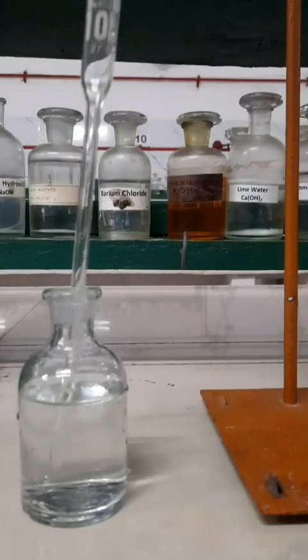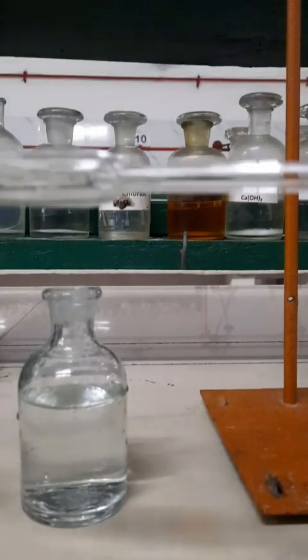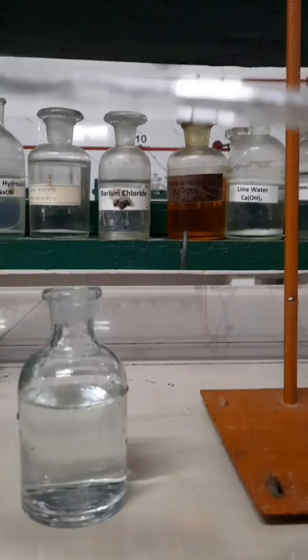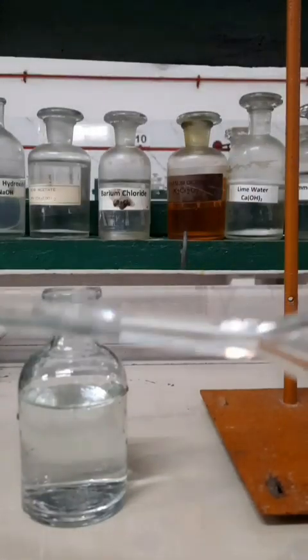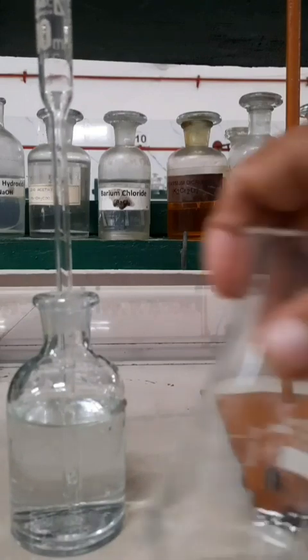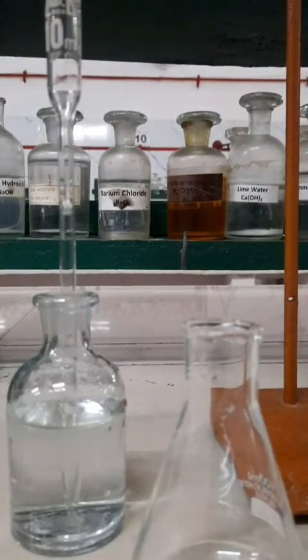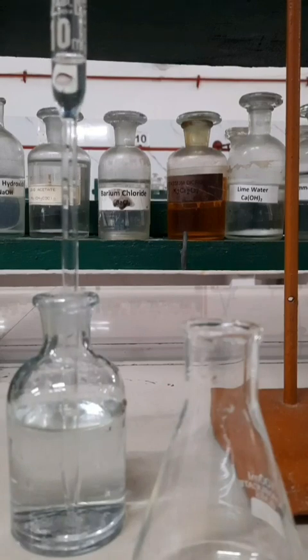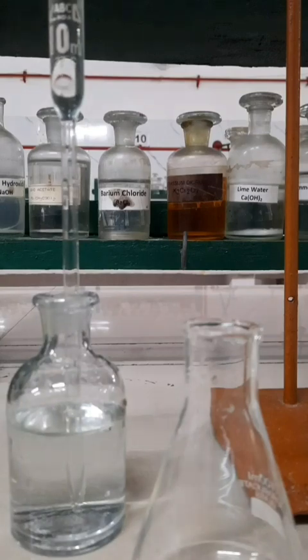the initial reading at 0 ml, you have to rinse the pipette. Now here I am taking a 10 ml pipette and rinsing the pipette with the standard Mohr salt solution in order to remove the water on the inner wall of the pipette, such that it may not contaminate the solution or alter the strength of the standard solution.